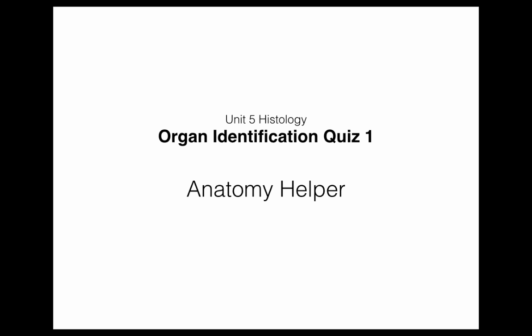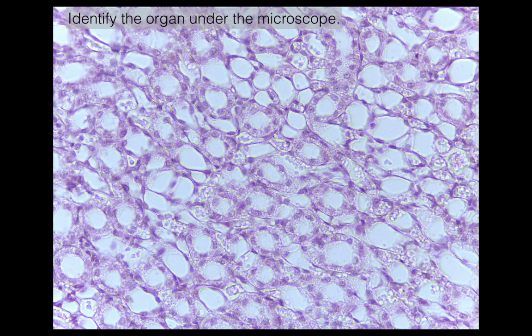In this video we're going to do unit 5 histology, focusing on organ identification. As you know from taking your exams, if you miss the organ identification it's easy to miss three or four more points on the other questions that follow it. So let's get started — I'm going to give you a minute to identify the organ under the microscope.